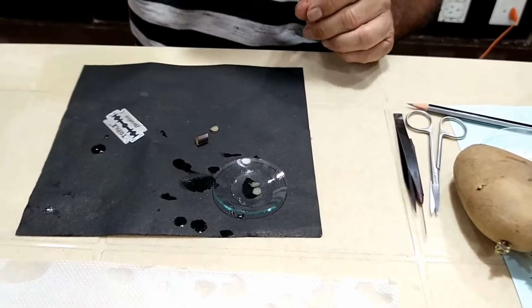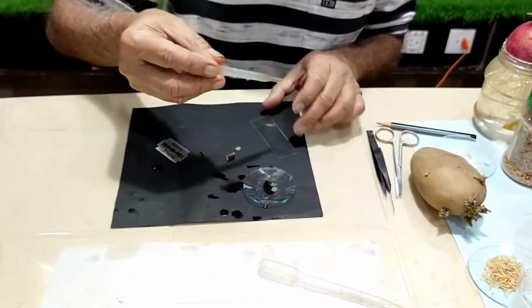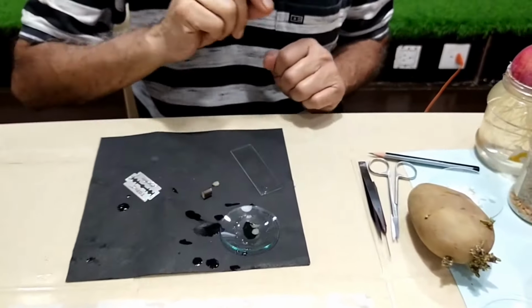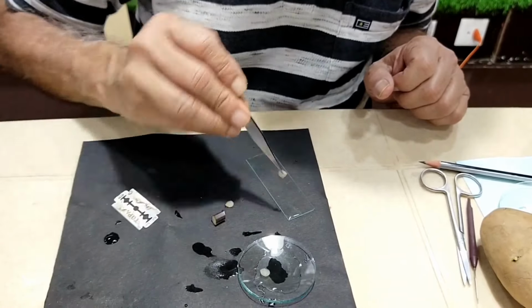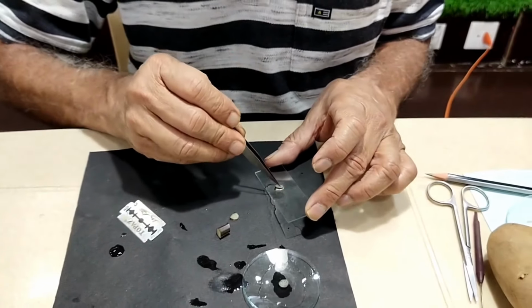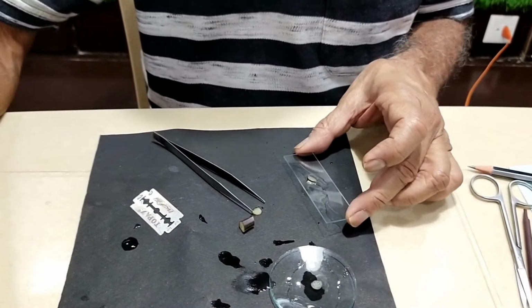I'll just take a drop of water here and then put this section on the drop of water. This is what I am trying to put here. Can you observe this? And I'll put a cover glass.